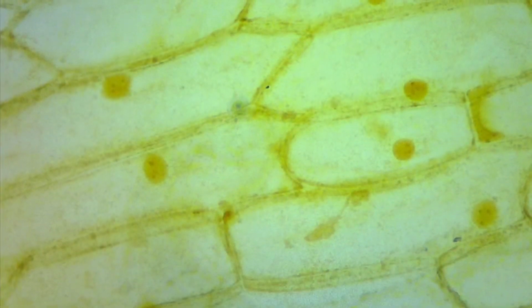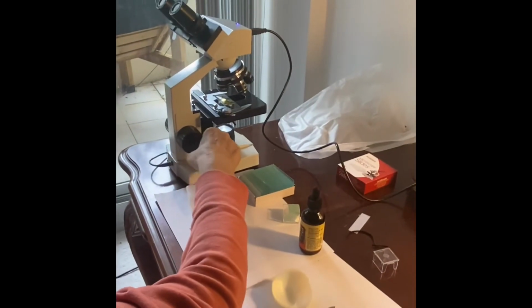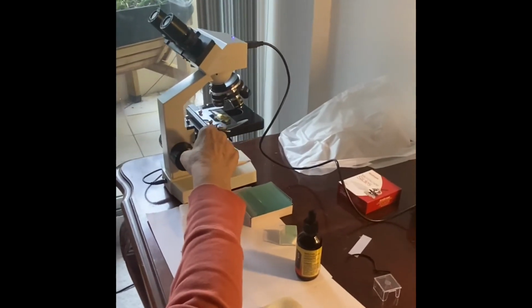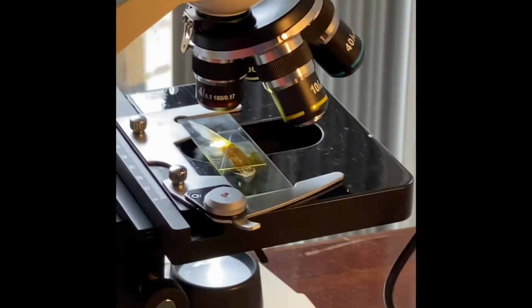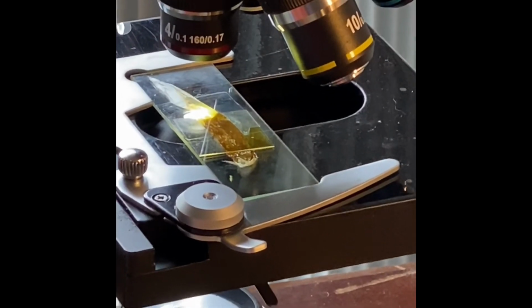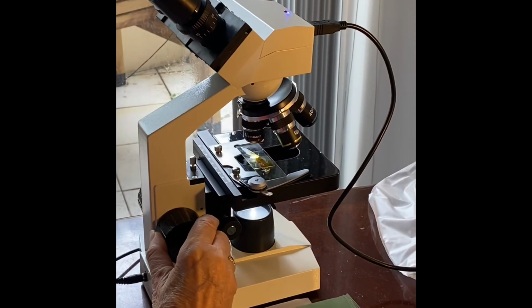And let's go back to the microscope. Okay, set the initial magnification on 4x. And then use the coarse adjustment to do the major focusing.